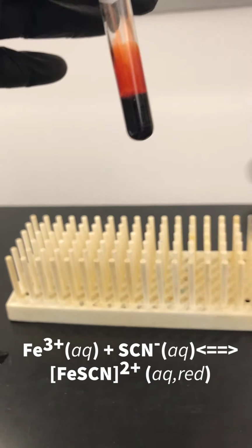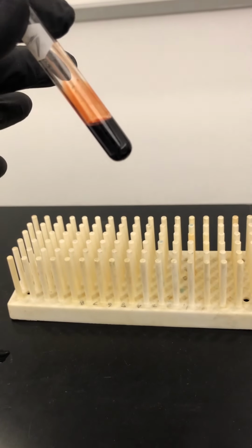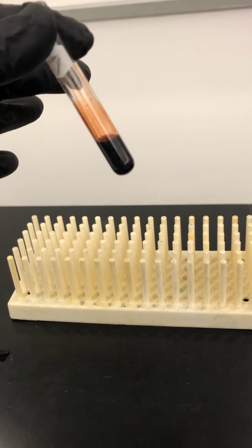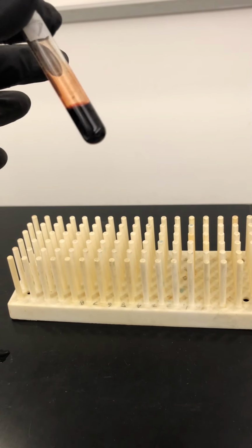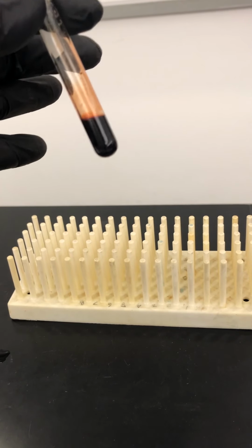And as you can see, we have the formation of a very deep red colored solution. That is your confirmation for the presence of iron thiocyanate. In other words, the presence of iron 3 ions in your original mixture.